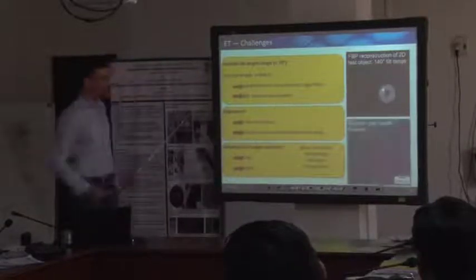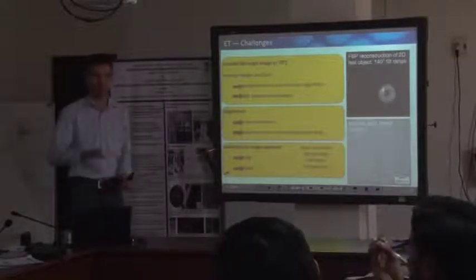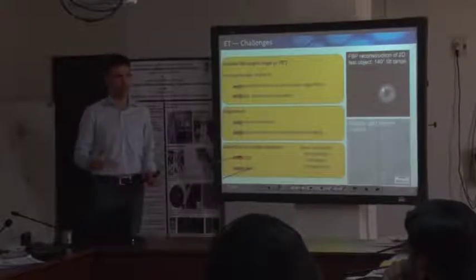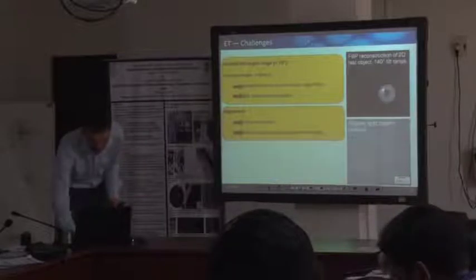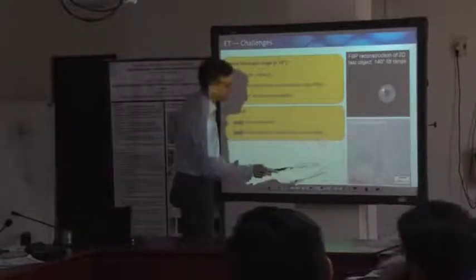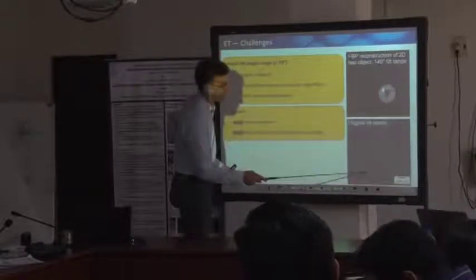The alignment: we have to think about how to align the tilt series very well, because any misalignment of your tilt series, like a shift of those images, would immediately cause some artifacts during the back projection or the reconstruction. This is how the tilt series intrinsically looks, and you might think about that there is the tilt axis. These are some marker particles.